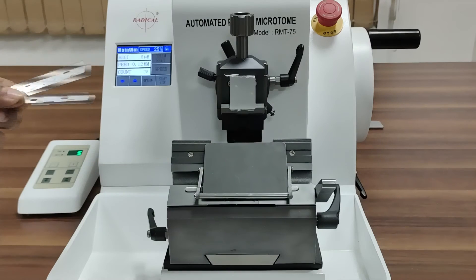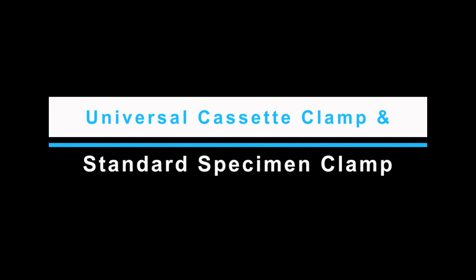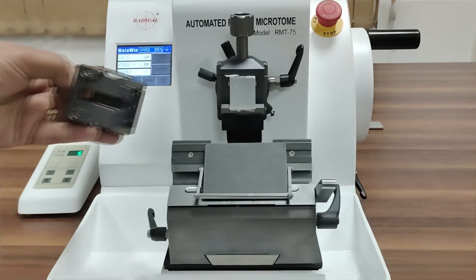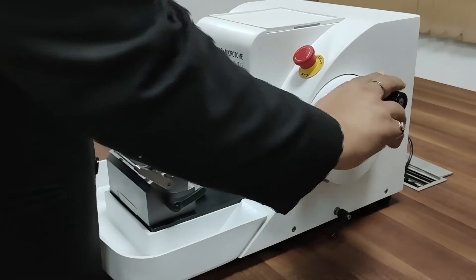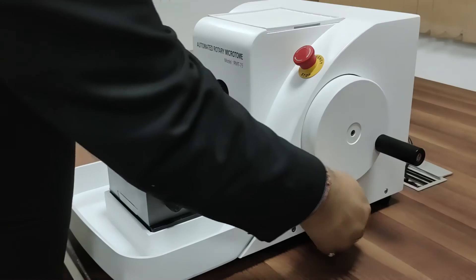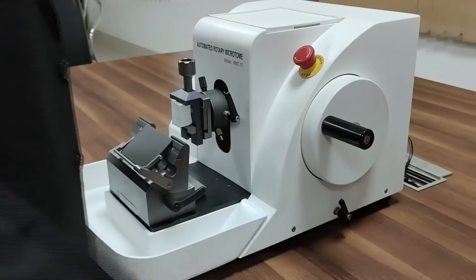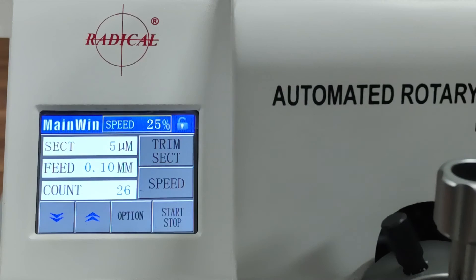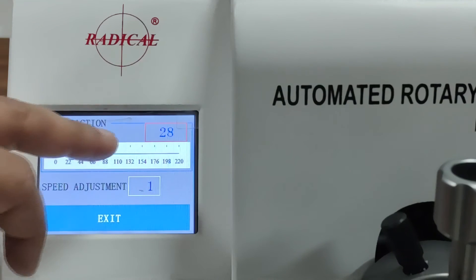Model blade carrier for high and low profile disposable blades. Universal cassette clamp and standard specimen clamp. Special function of specimen retraction with adjustable retraction.